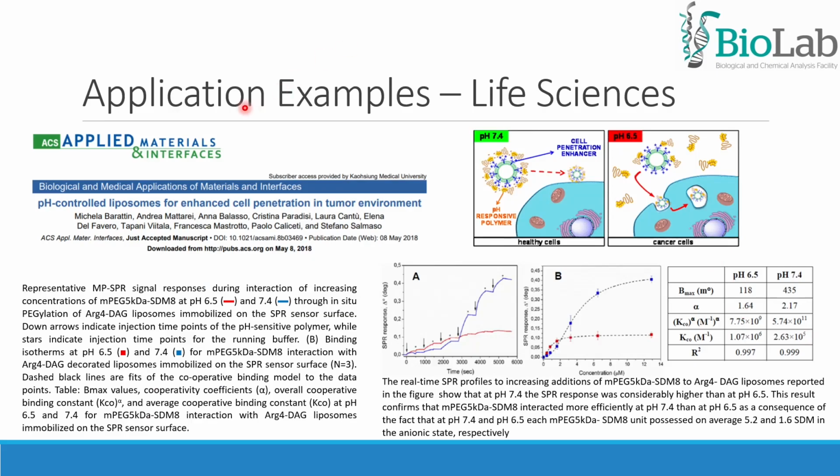In this other example, the researchers were trying to develop a pH-switchable colloidal system that could be exploited for site-selective anti-cancer drug delivery. They developed a new liposome coating that has a cell penetration enhancer, CPE, and a pH-responsive polymer, which allowed for the controlled intracellular delivery of model macromolecules and small molecules loaded in the liposome under tumor acidic conditions.